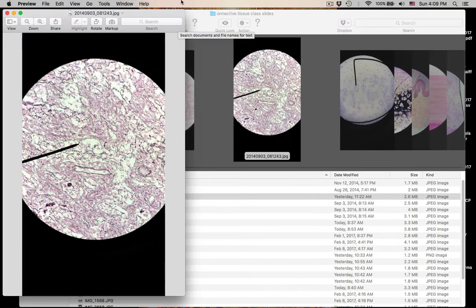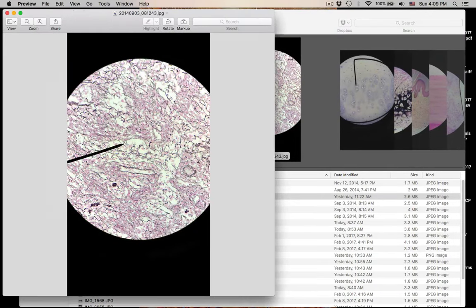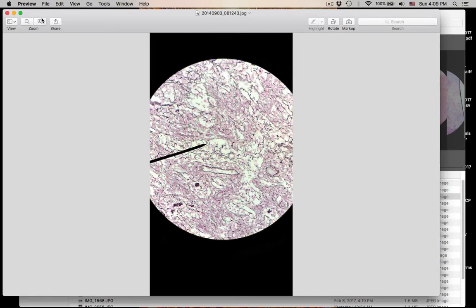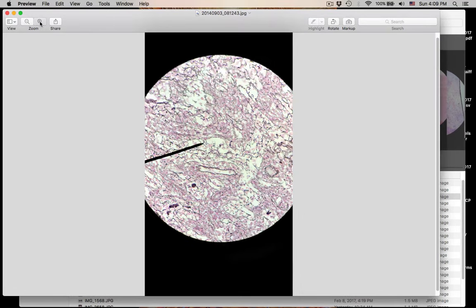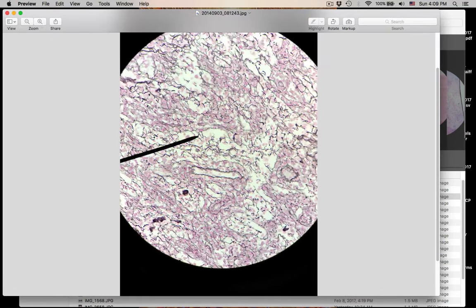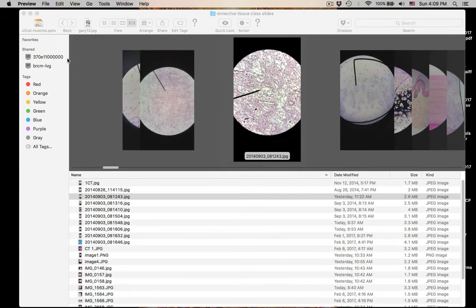Number three — that was a really nice picture. This is reticular connective tissue. Reticular connective tissue.